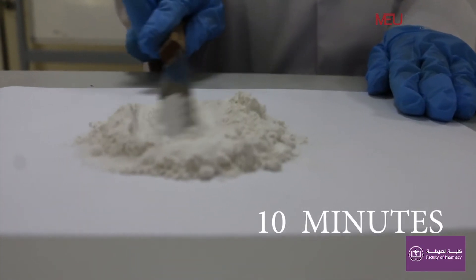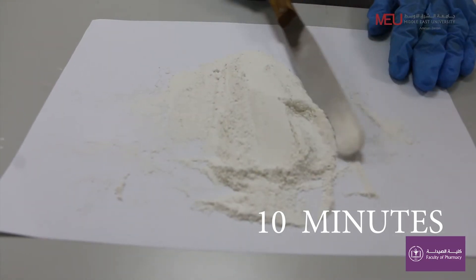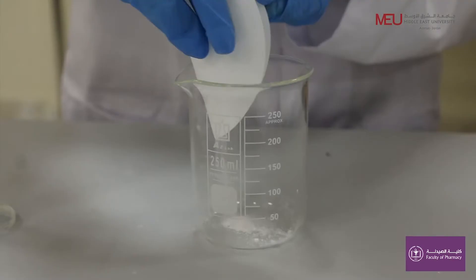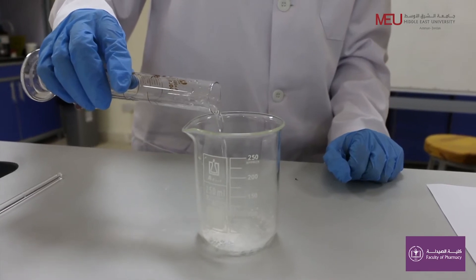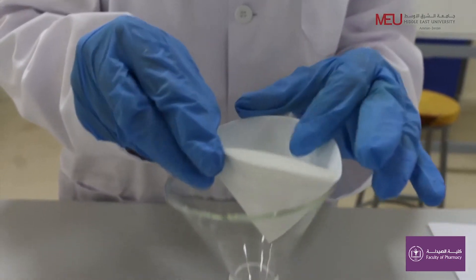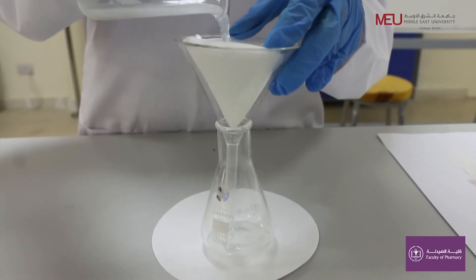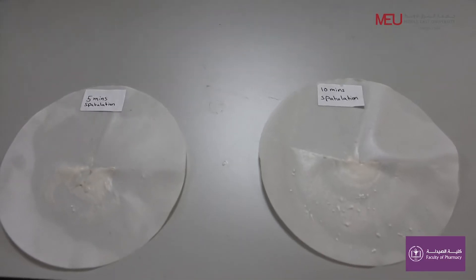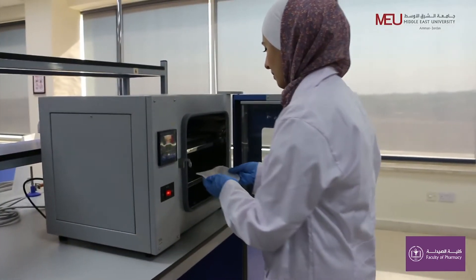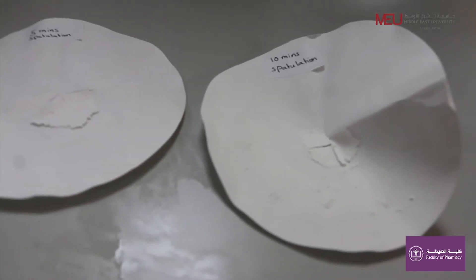Continue mixing for another five minutes, for a total of ten minutes. Take another one-gram sample from the mixture and repeat the steps again. Dry the filter paper in the oven and determine the amount of talc retained on the filter paper.